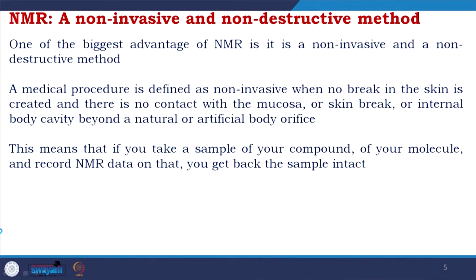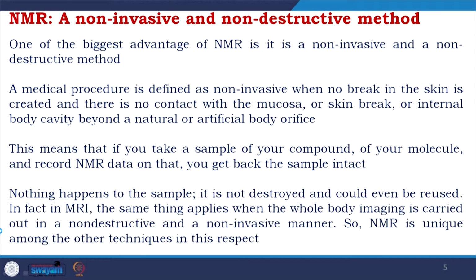So, in those sectors non-invasive techniques are really getting popular. NMR is a non-invasive technique, and this means that if you take a sample of your compound, of your molecule, and record NMR data on that, you get back the sample intact. Nothing happens to the sample, it is not destroyed and could even be reused.